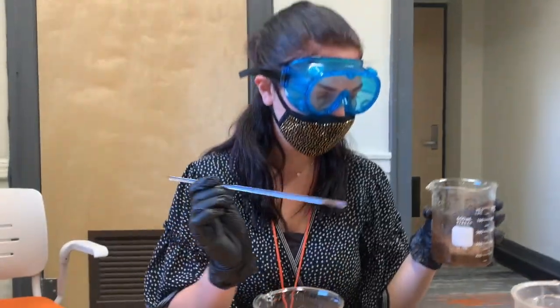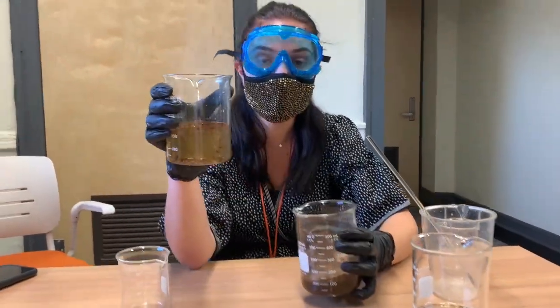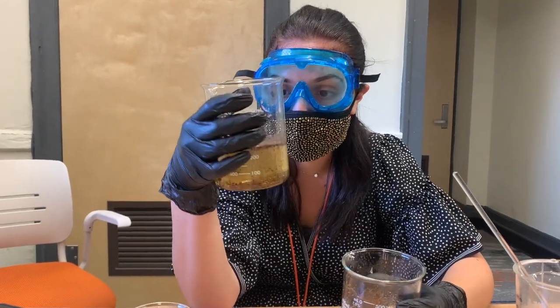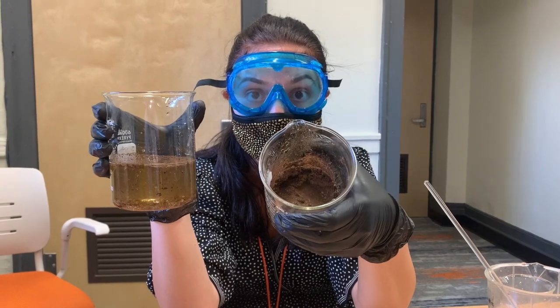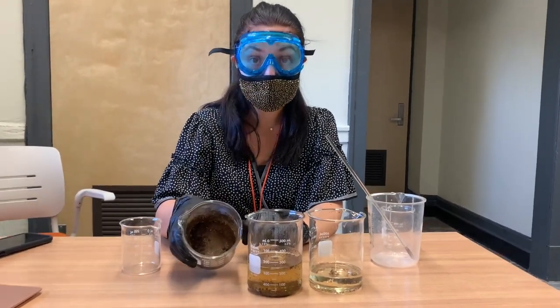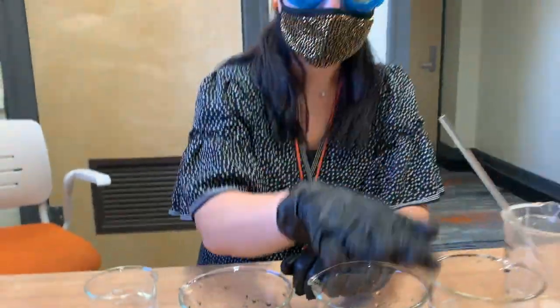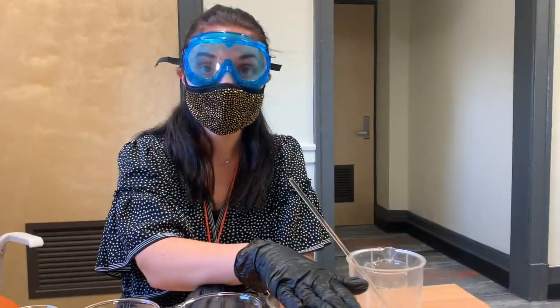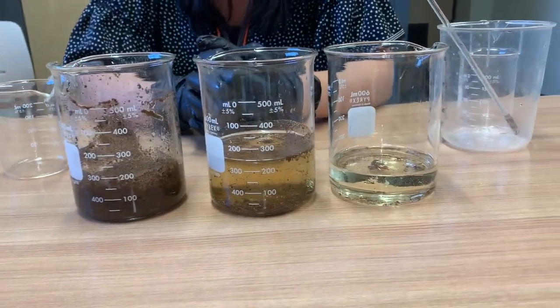And would you look at that? Sure, you have some pretty dirty water, but it's water nonetheless. And we separated it from the actual dirt. So here you have your dirt, which looks dry. Your water and your oil, completely separated. Decantation.